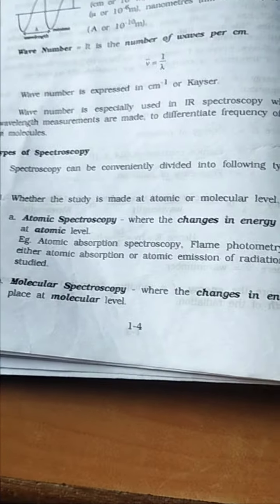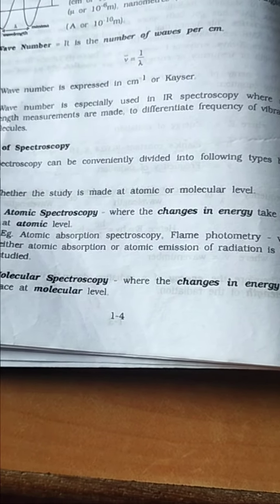First, atomic spectroscopy is changes in energy at the atomic level. Examples: flame photometry, atomic absorption, atomic emission of radiation. Molecular spectroscopy means changes at the molecular level.